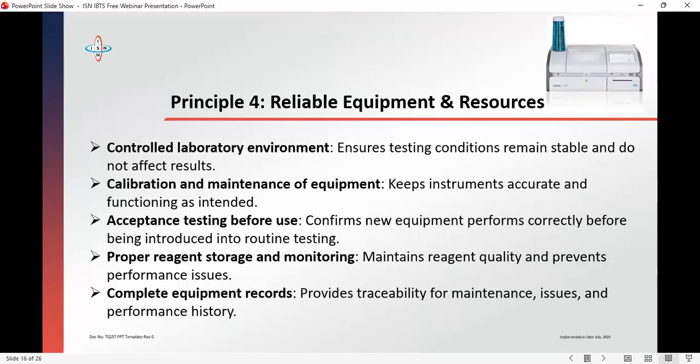If it fails calibration, yes, MLSCN now is calibrating pipettes, and they are calibrating even timers and temperature monitoring devices like our thermometer. They have to be calibrated to ensure that they are monitoring and dispensing in the right way. Imagine even our watch that we wear on our hands needs to be calibrated, but who cares when we have phones and every other thing that we can see? When the battery goes down, the timing is also going down. It will not function well.